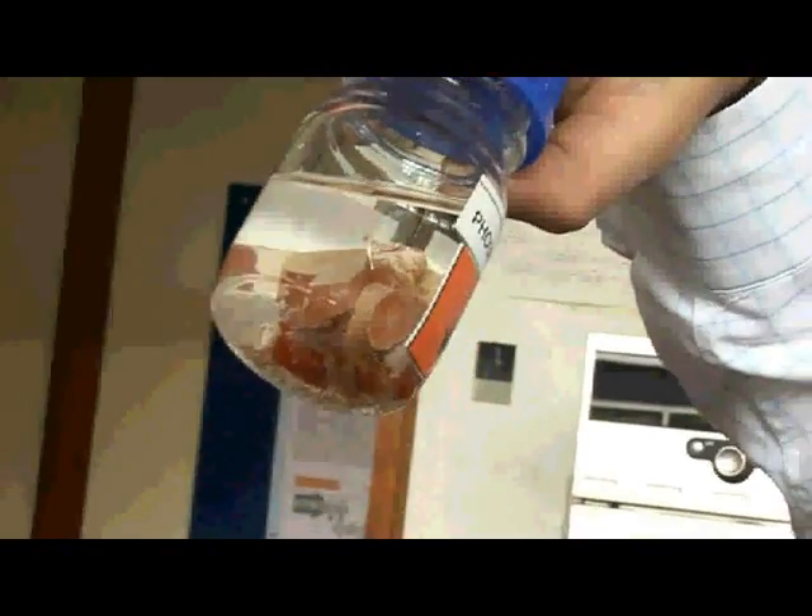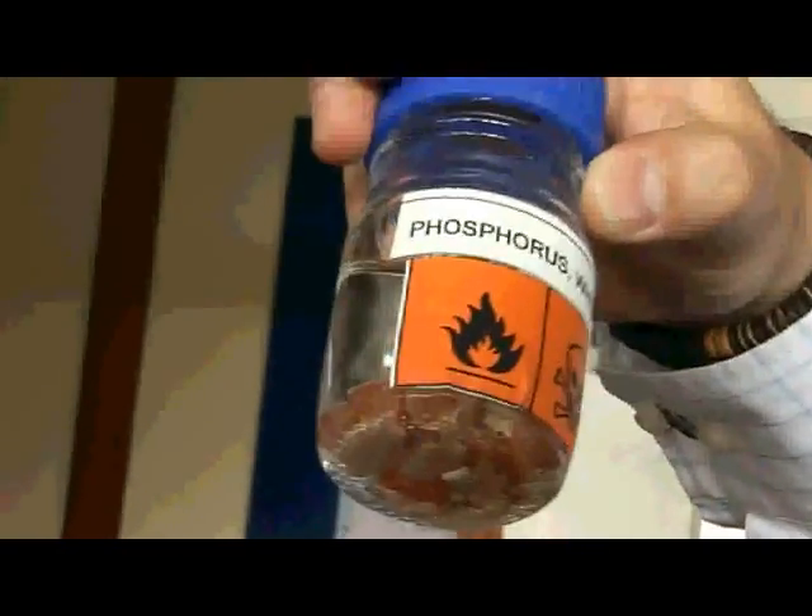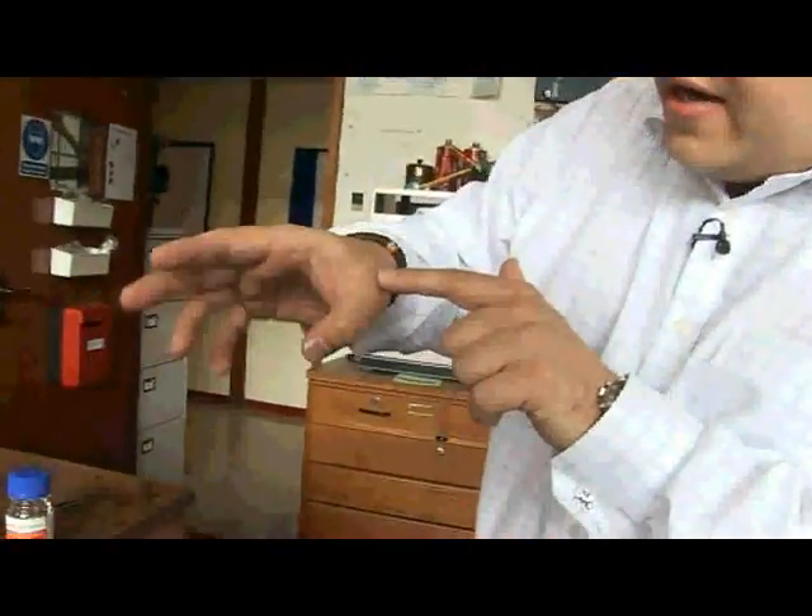You'll notice the phosphorus is stored underwater, to keep oxygen and the atmosphere away, because it reacts very vigorously and can burn — hence the flammable warning signs. It's so flammable in fact that it burns just with the heat of the skin. You can see a number of scars across my hands — these are all from playing with phosphorus and doing reactions and experiments with it.